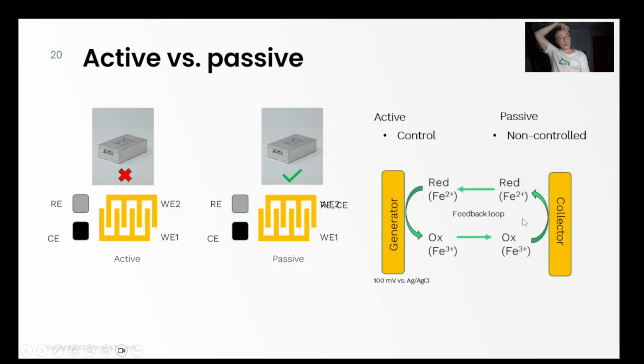But I don't know your chemistry, so I've sort of said here that if you set up this system where you've just had 2 interdigitated electrodes, so let's say they were both gold, and you were oxidizing ferrocyanide to ferricyanide on the working electrode, on the collector electrode, which is really the combined counter and reference, you would end up reducing ferri back to ferrocyanide.